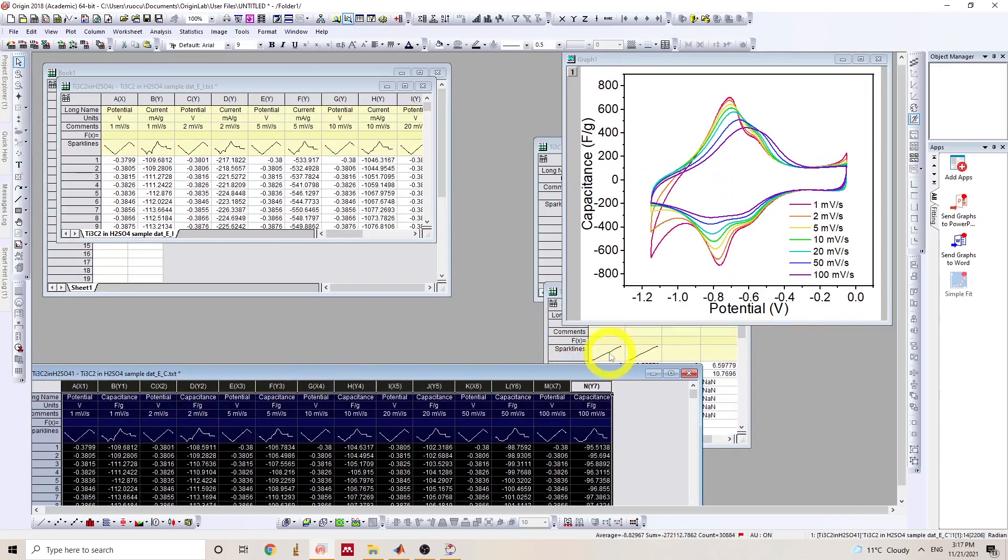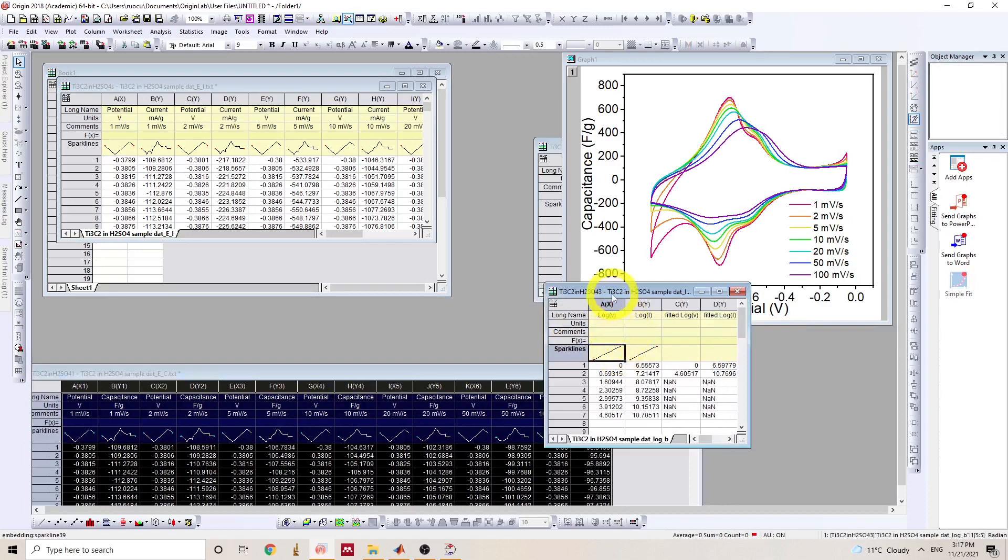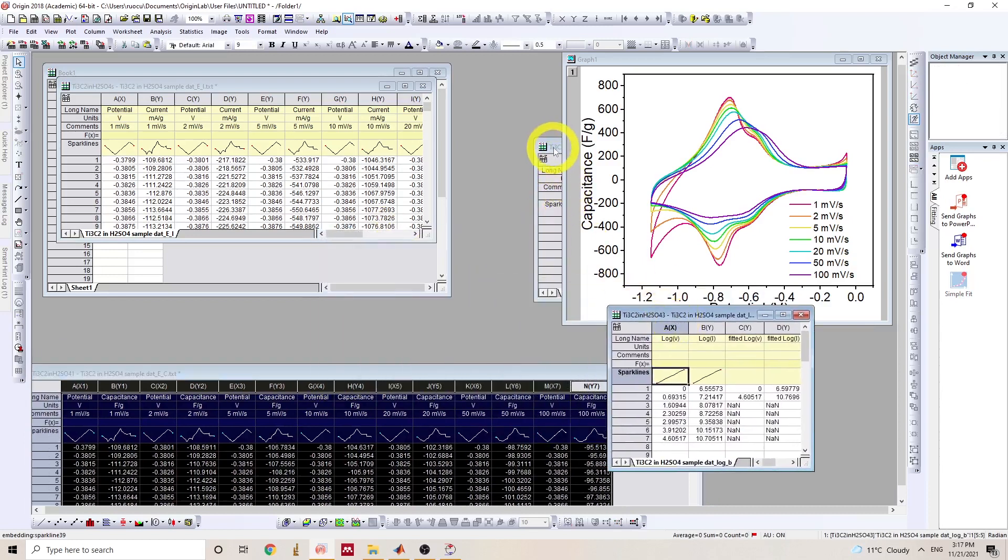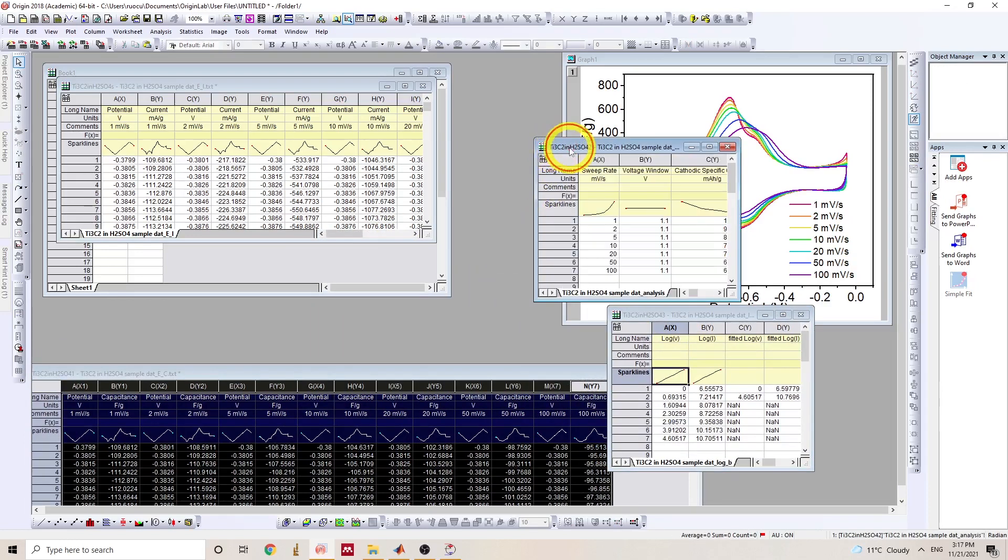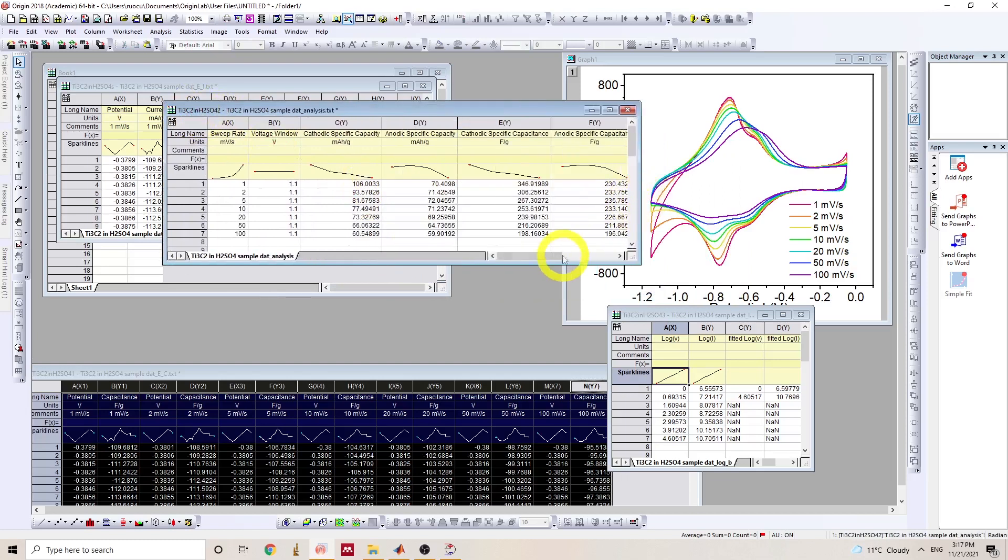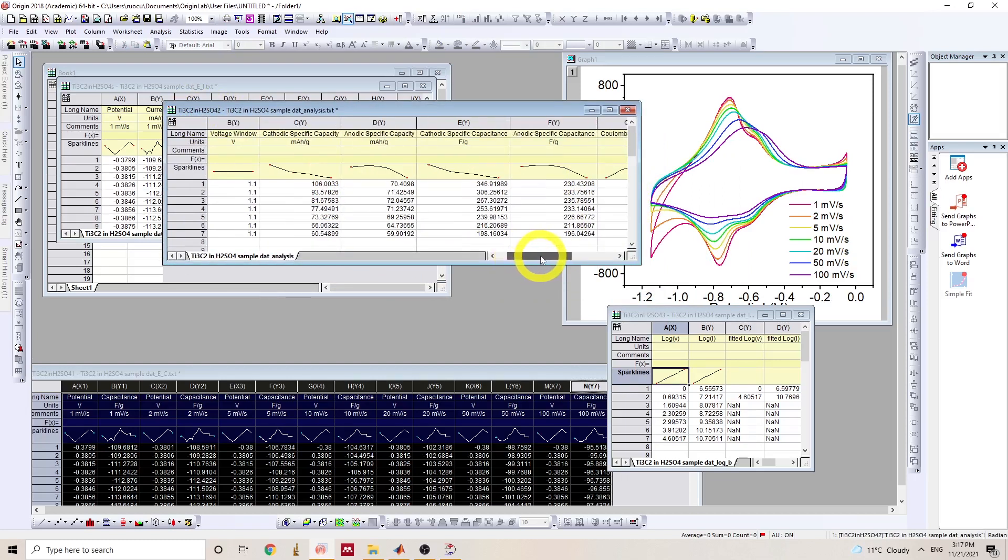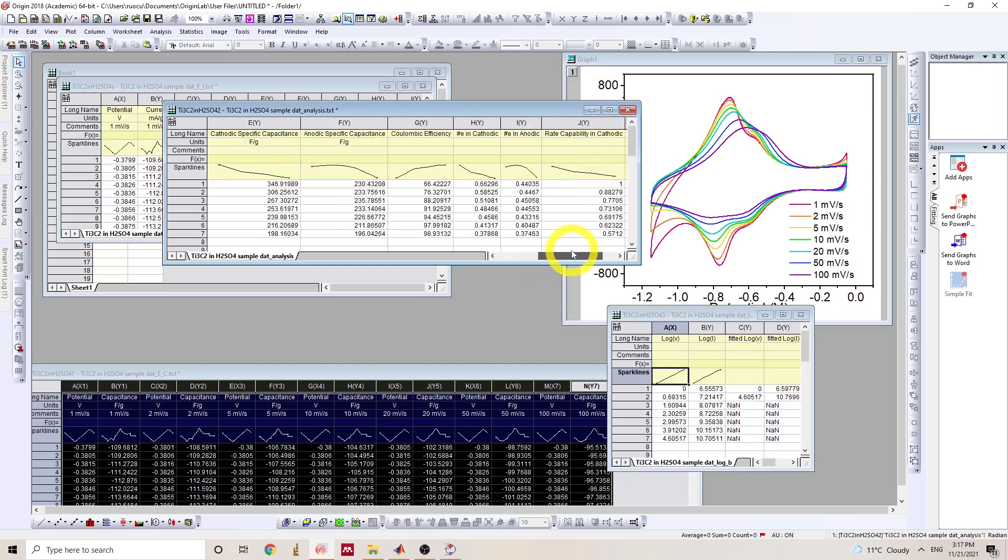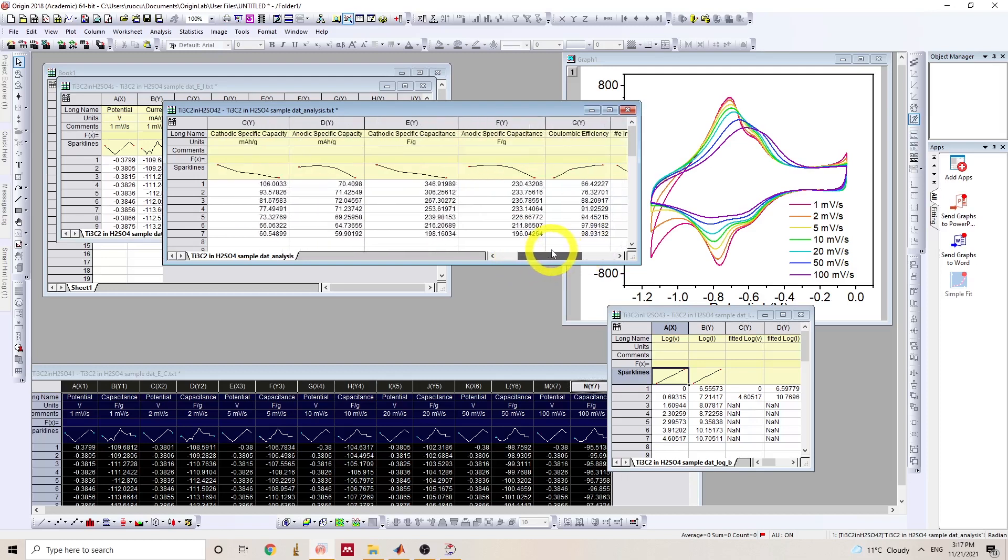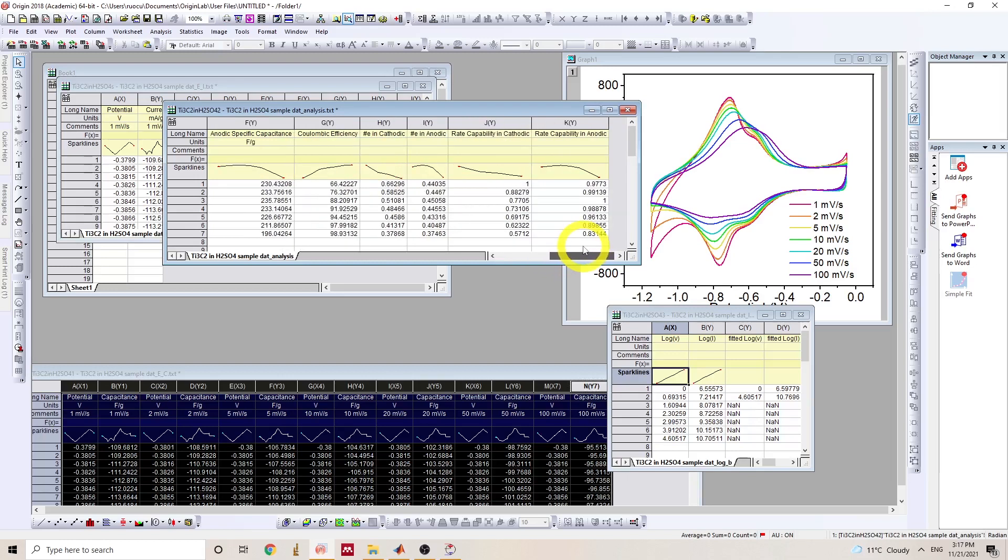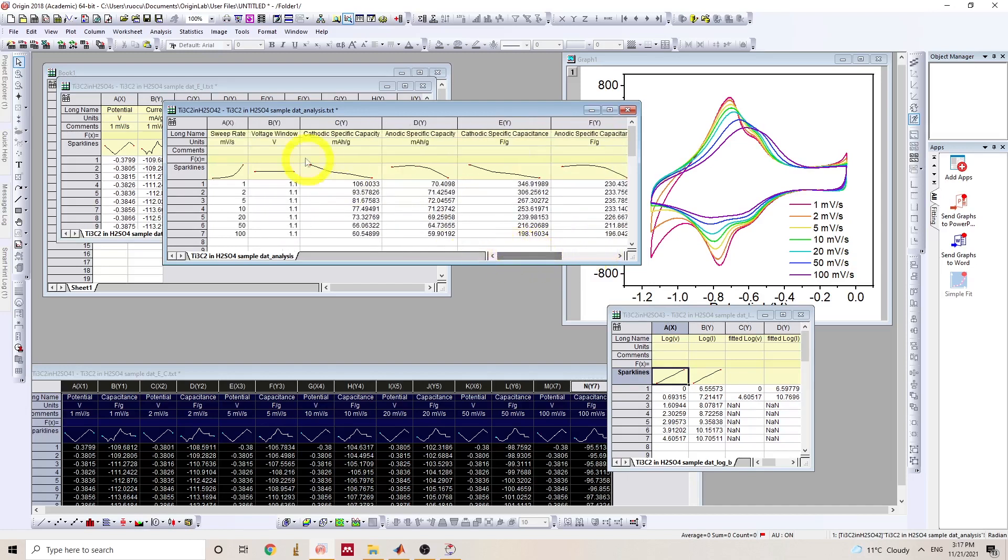And next, we can plot the analysis results depending on which light. The analysis file contains a lot of parameters calculated from the CVs, including capacity, capacitance, coulombic efficiency, number of electrons transferred per formula unit, and the rate capability.